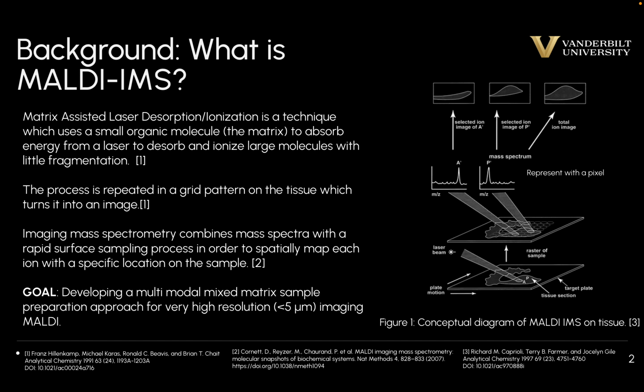This summer, our goal was to develop a sample prep approach in order to create high resolution, so sub 5 micron, images using MALDI. By being able to image at a very high resolution, we then would be able to turn it into a multimodal mixed matrix sample prep. And thus, we would then be able to apply different methods and modalities to the exact same tissue without having to get a new sample.